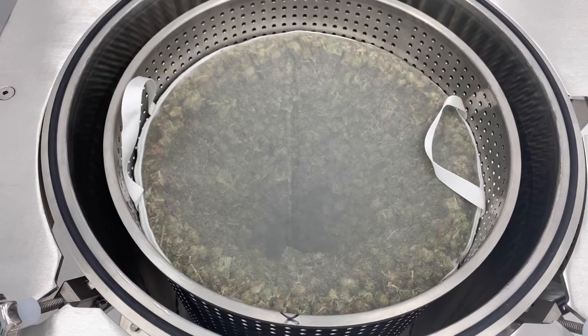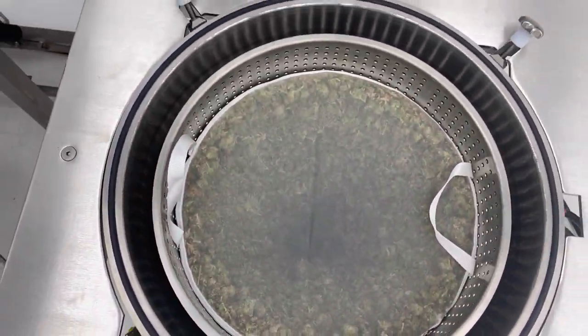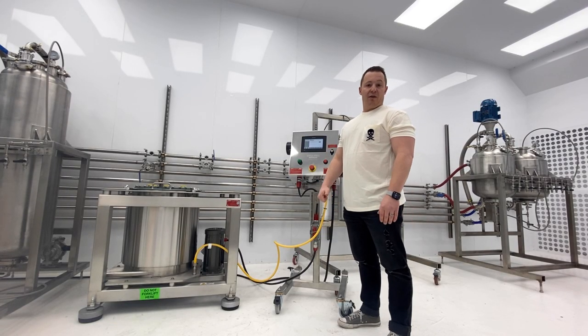The third feature is that we're working on a heptane conversion for this system — more details to come on that. It's going to allow you to run fresh frozen material, as well as some other exciting features. Stay tuned and we'll get you more information.